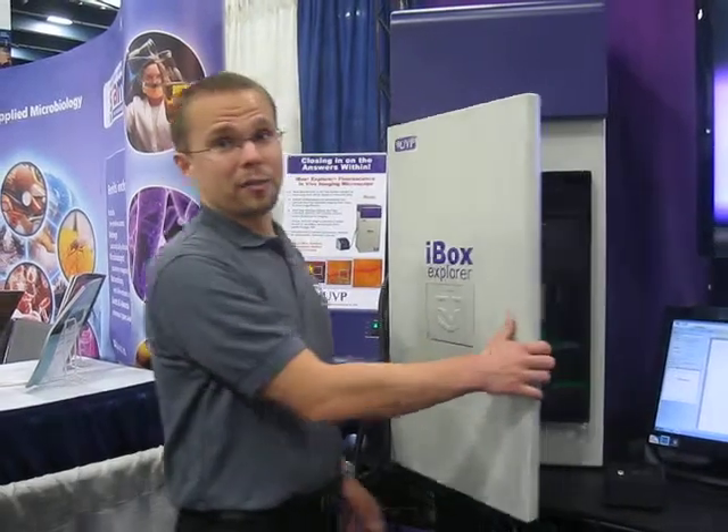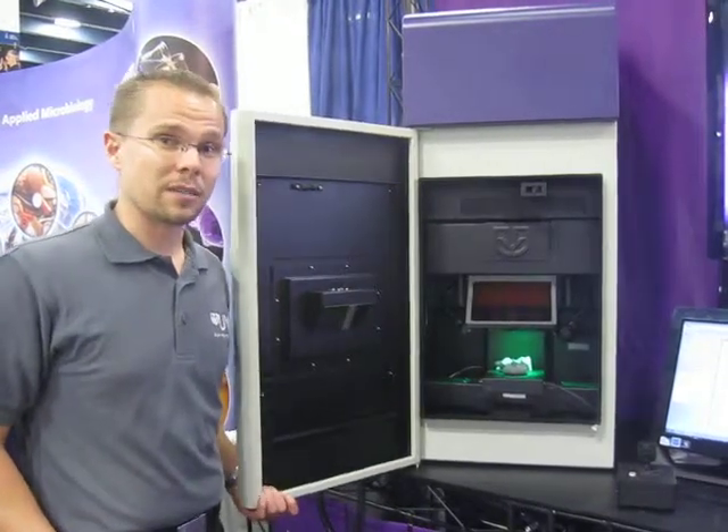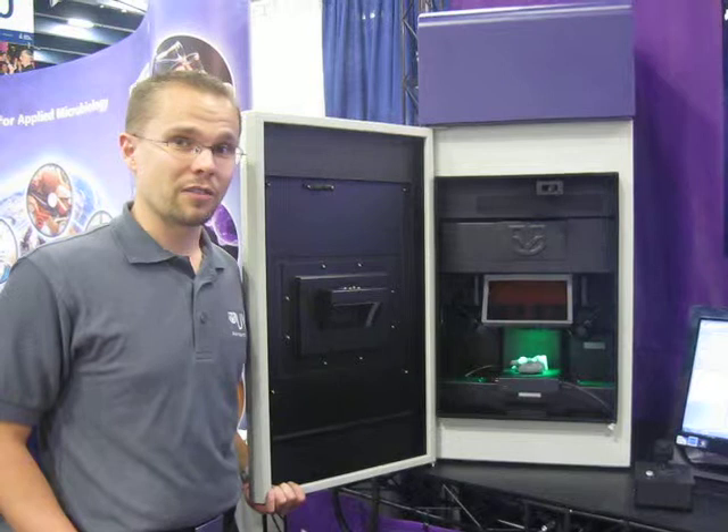The microscope here is different from any system that we have in our lineup in that it's actually a microscopy system enabling imaging from 0.5x up to 16.5x magnification of a small animal.